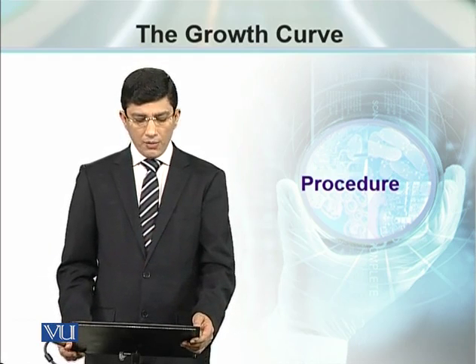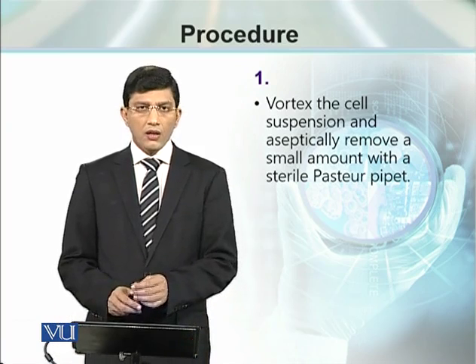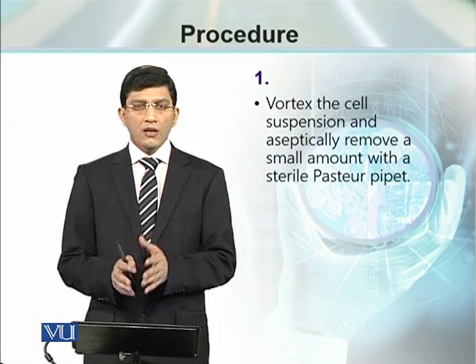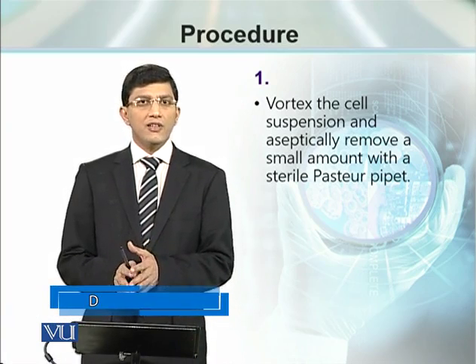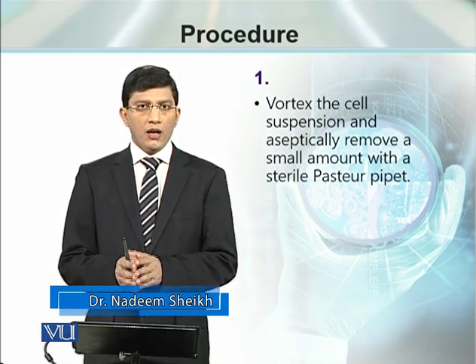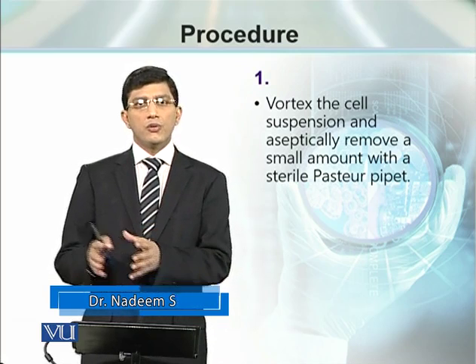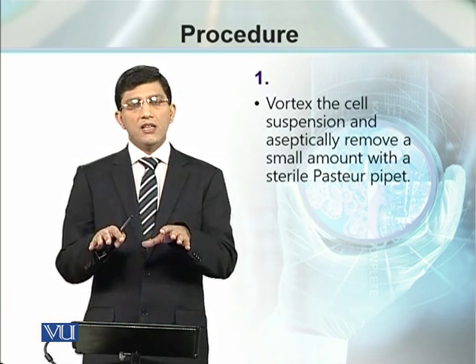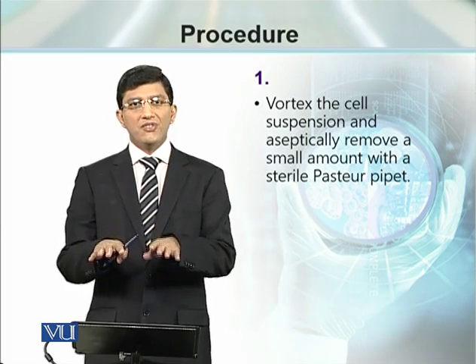From our given sample, we will vortex the cell suspension. Vortex करना इसलिए ज़रूरी है, cells are 3-dimensional structures. अगर आप एक कल्चर को कुछ देर के लिए अनडिस्टर्ब छोड़ दें, सेल्स अपनी डेंसिटी की वजह से बॉटम पे सेटल कर जाते हैं.